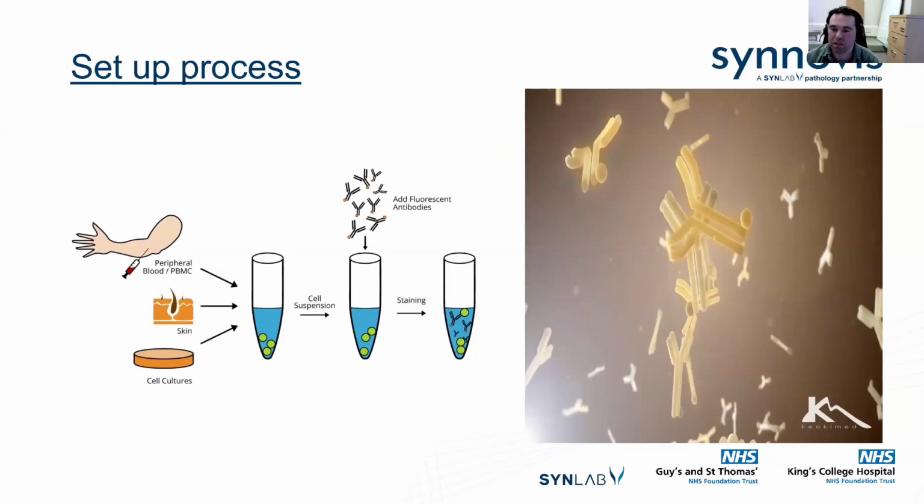The setup process: we take blood, we create a suspension, we add antibodies to the blood, we then incubate in the dark.